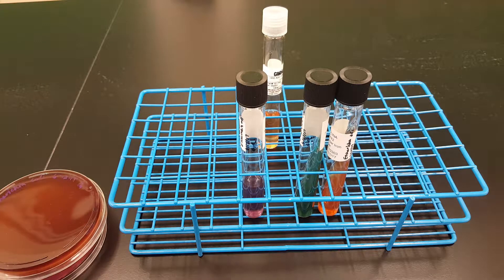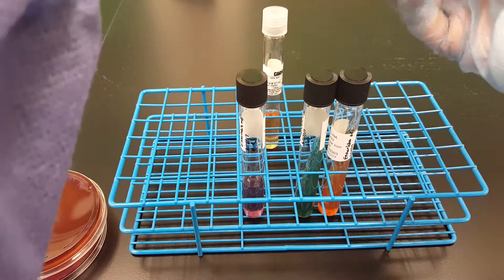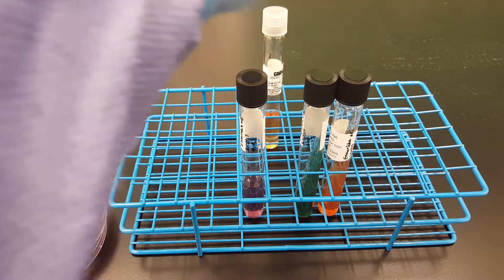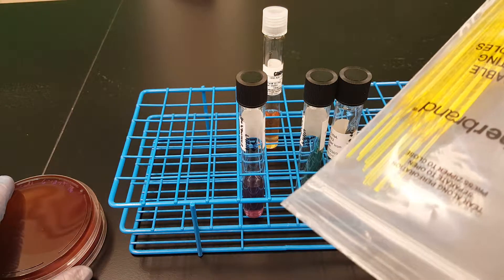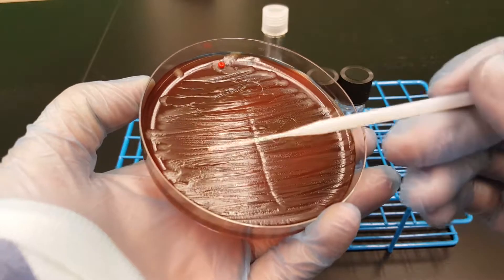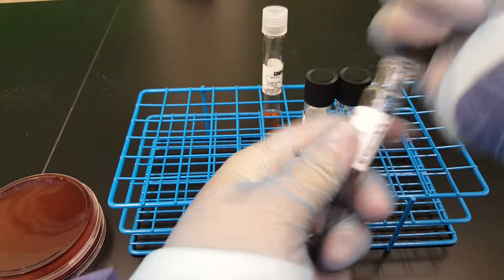The next one I'm going to do is the MIO, which I will use a needle this time because I want to show you the difference of the inoculating procedures that you can use. You can use the needle tip of your other loop, but you don't have to — you can use an actual needle.